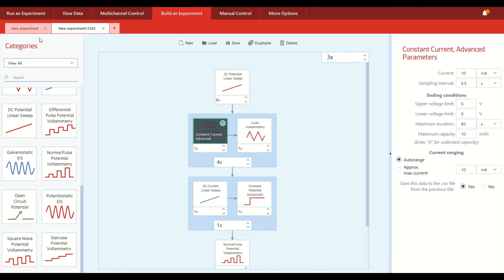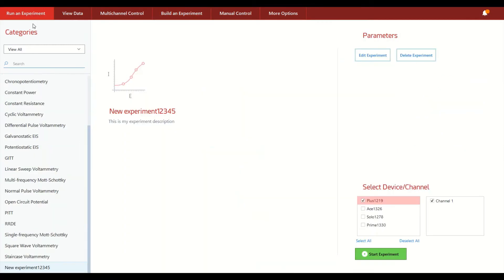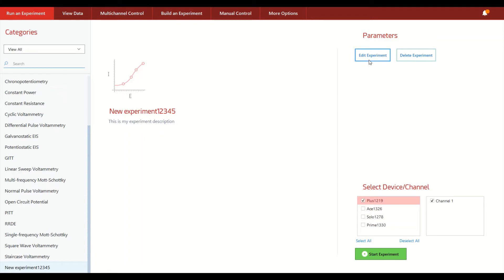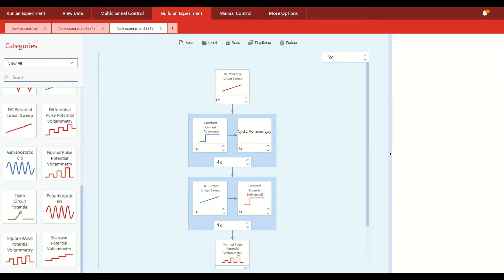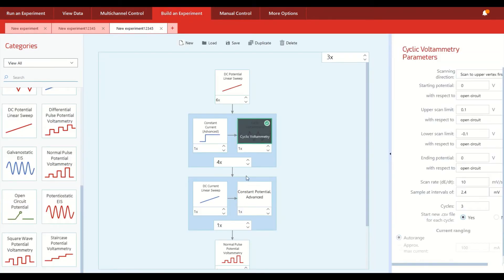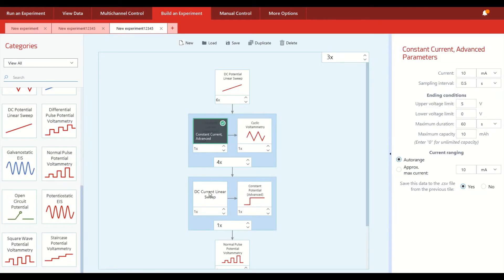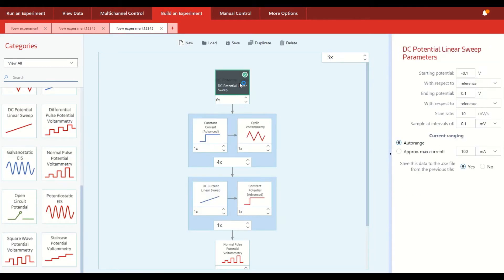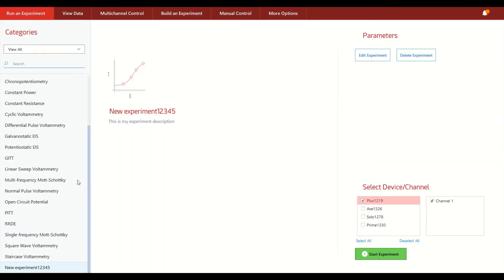And once you save your custom experiment, it becomes available in the run an experiment screen. So we see this new experiment is now down at the bottom with the experiment description that I wrote. And the experiment parameters are viewable by clicking Edit Experiment, which takes you back to this window to check or edit the parameters to run.